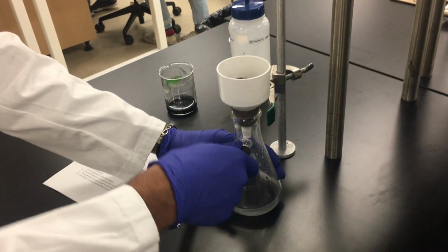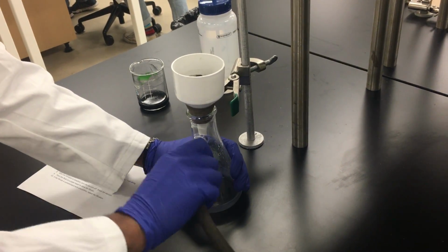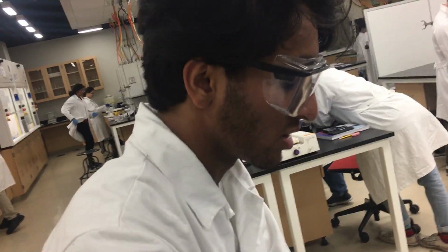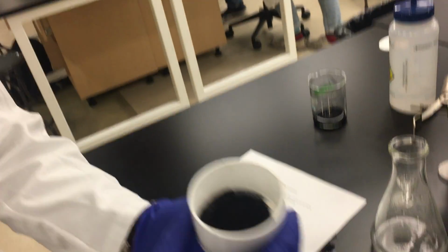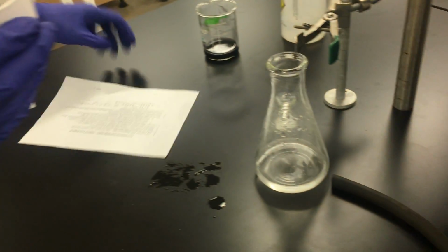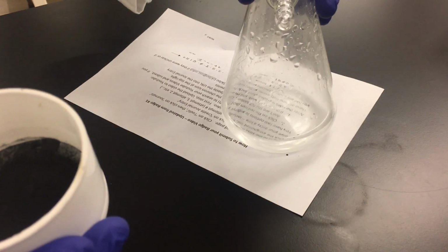And we're going to unclamp this flask. Now this is organized into two parts, the original solution. There's a precipitate which sits on the top, and as we can see, that is right here. It's all the black, and since it's filtered, what we can also see is that the solution is clear. And we put it against a white background to make sure we can see that clarity, and perfect.